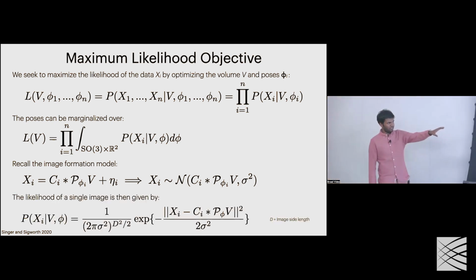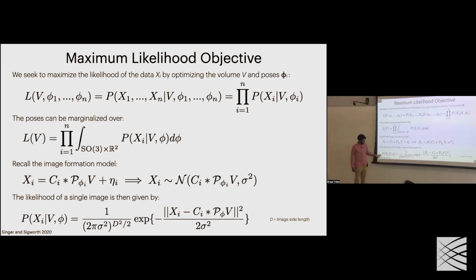And so given that interpretation of the image, the likelihood of observing the image given the model parameters is just what you get when you plug the image into the Gaussian PDF for the multivariate Gaussian centered on this mean, which is the clean image, and with that sigma. If you recall the Gaussian PDF, it takes a form like this.